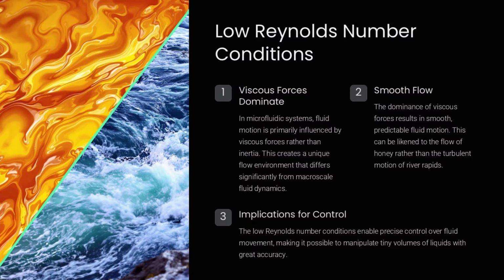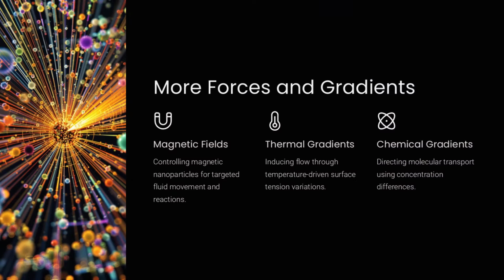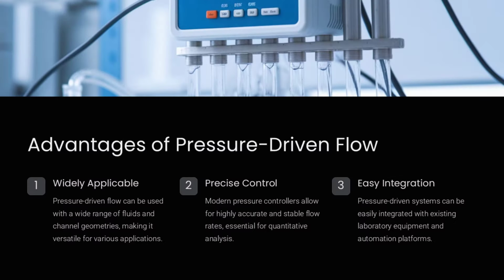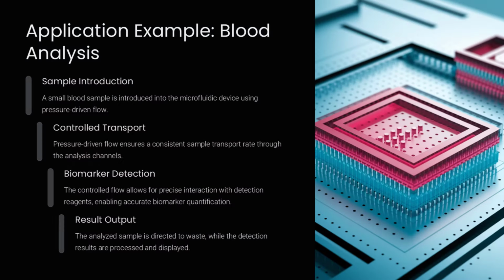Microfluidic flow control is crucial for precisely manipulating tiny amounts of fluids in lab-on-a-chip devices, biosensors, and chemical reactors. Unlike traditional fluid systems, microfluidics operates under low Reynolds number conditions, meaning fluid motion is dominated by viscous forces rather than inertia.